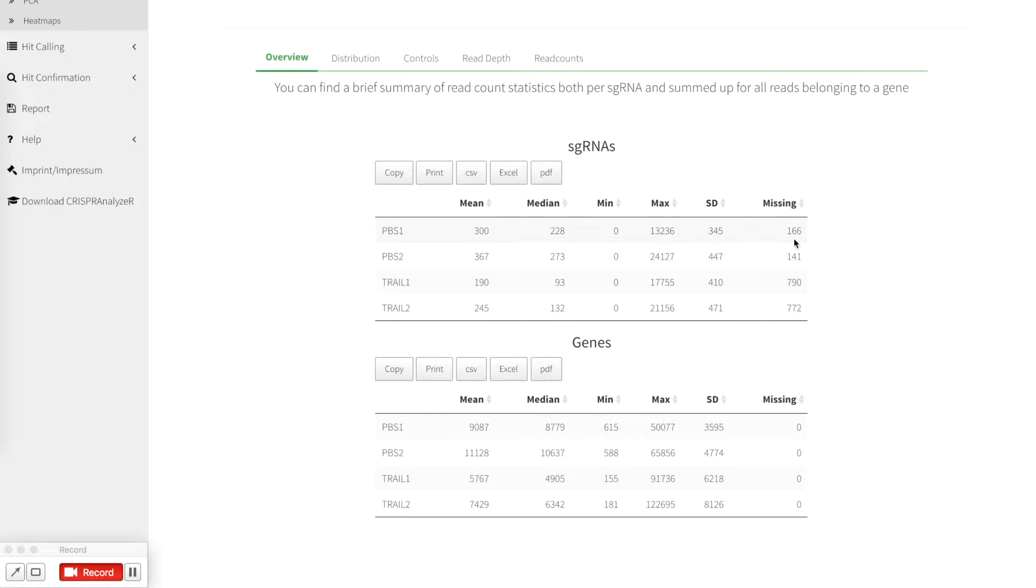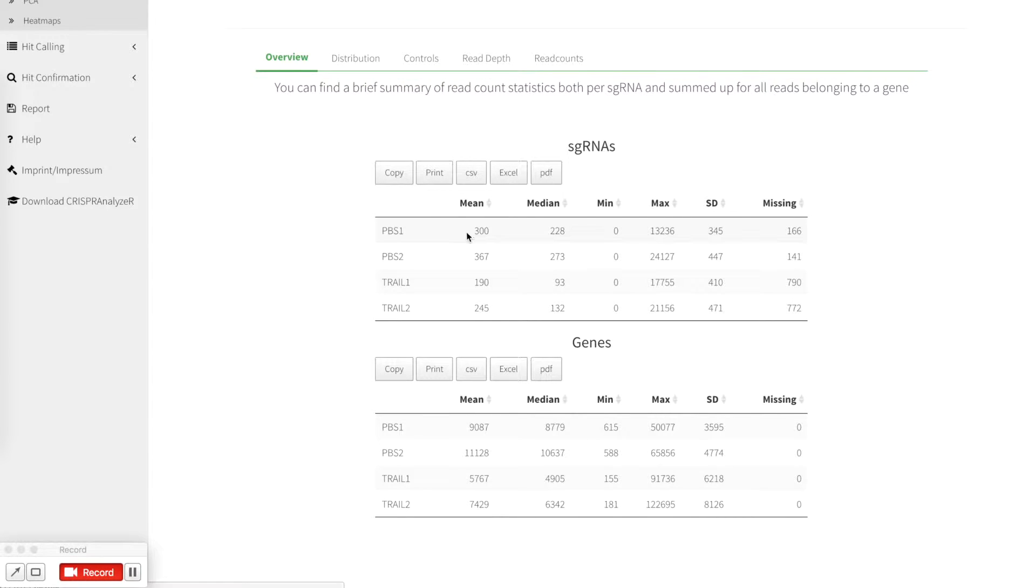What you can see here is that 166 out of 12,000 sgRNAs were missing in the sample data set. This means that a read count of zero has been detected.